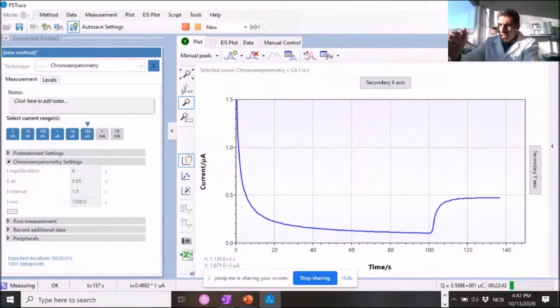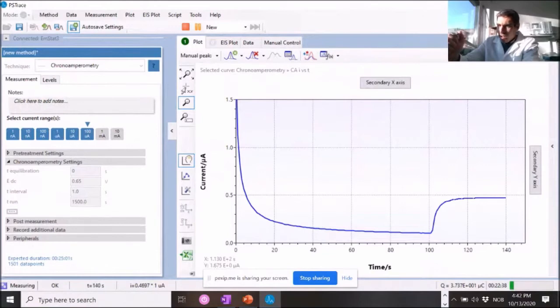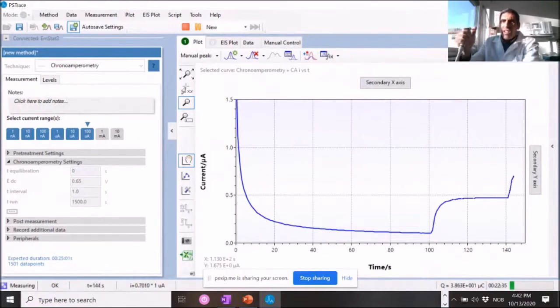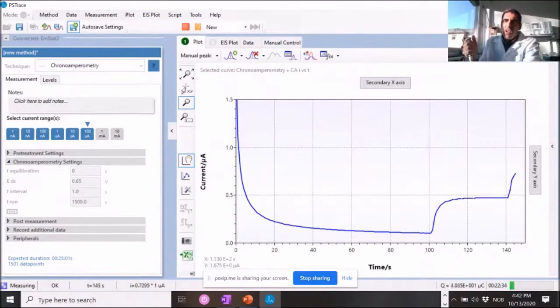So we are approaching the 140 second mark and here we go. So now we are looking at the 10 millimolar response.